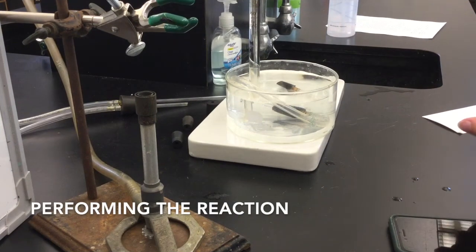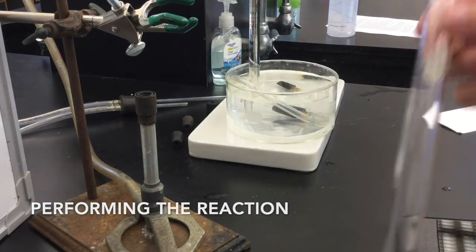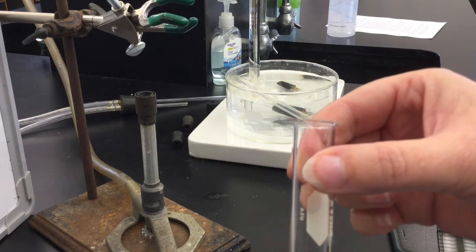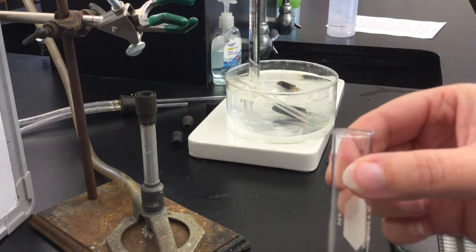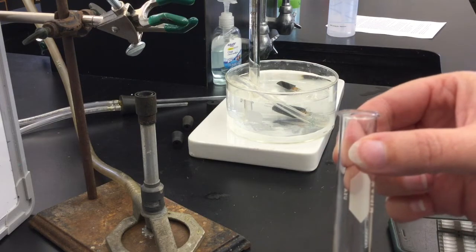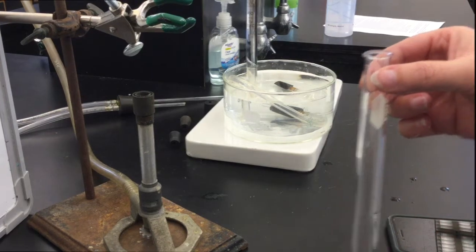Now you're about ready to get started with your heating. You're going to need to attach the other end of the tube to your test tube. It will be helpful if you have one person who is doing the attachment and the other person having a paper towel that can dry off the rubber stoppers so that it doesn't get water into your mixture, as that water will vaporize and add more gas. We don't want to do that.